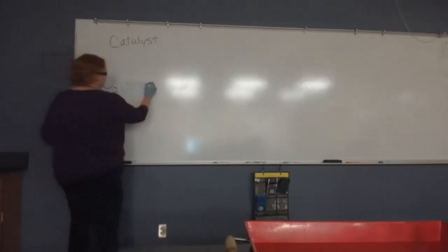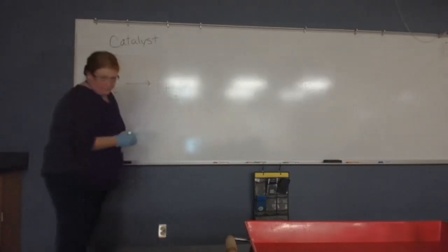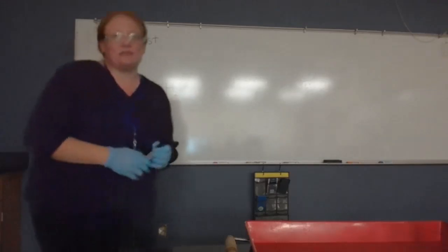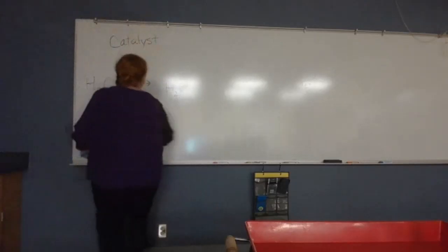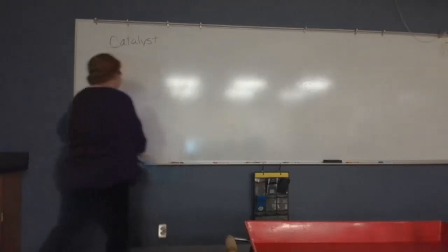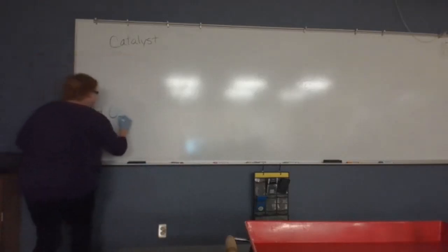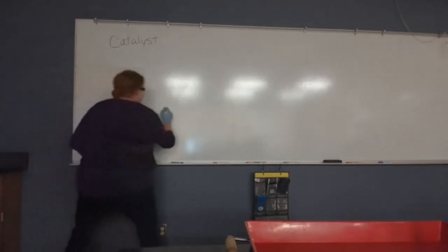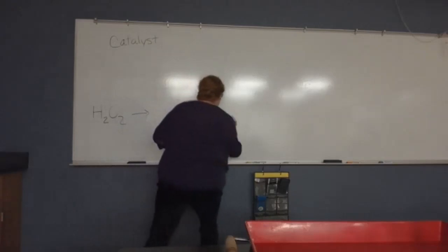And we are going to end up forming two products. We're going to see the evidence of these products when I demonstrate the reaction for you. I do want to note that you may have seen this reaction in videos, or you may have even done it.